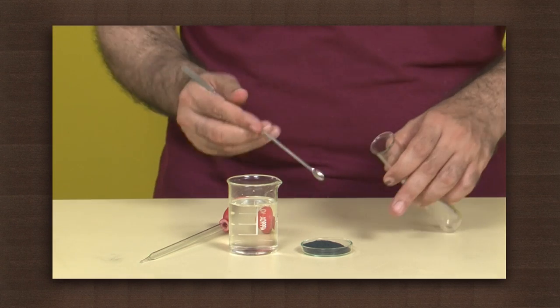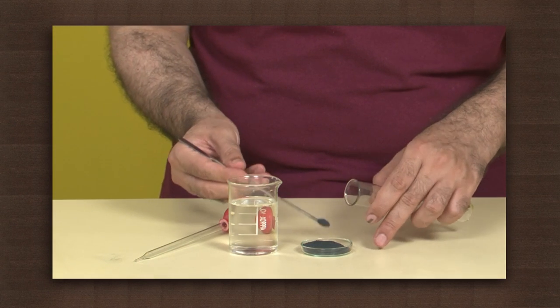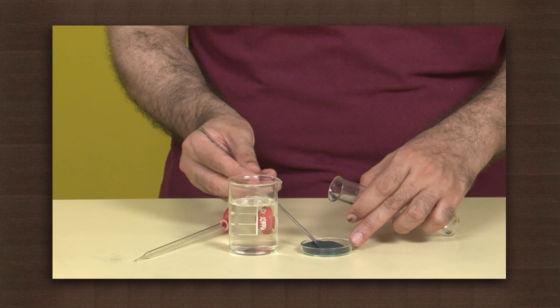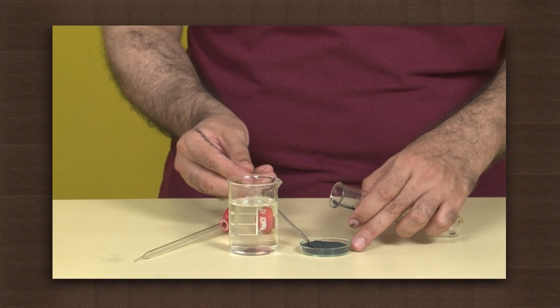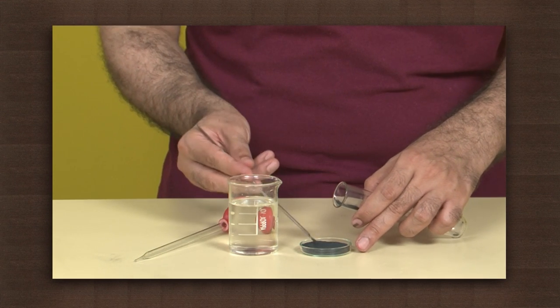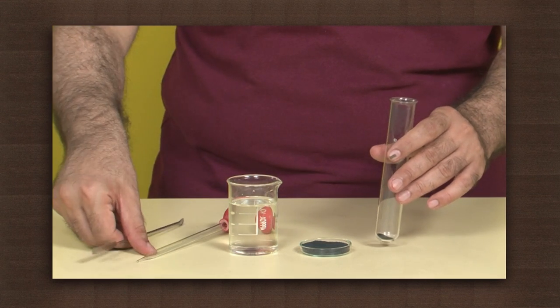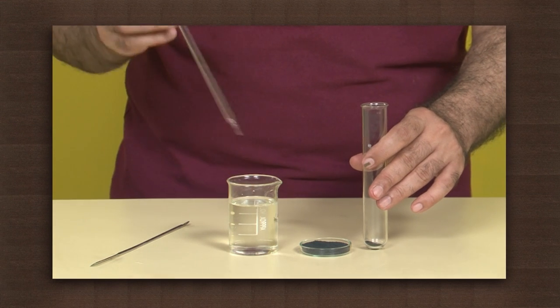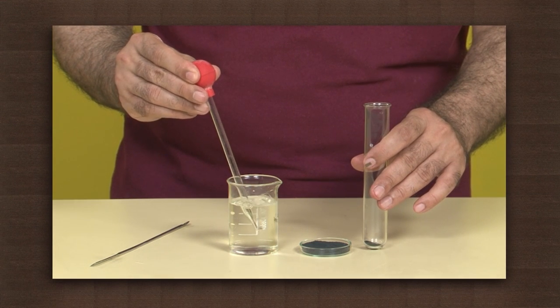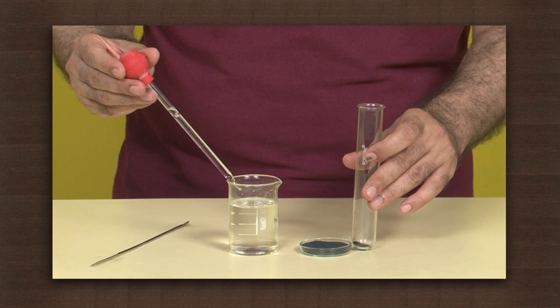Take some copper oxide in the test tube. Add dilute hydrochloric acid to it, drop by drop, and shake.